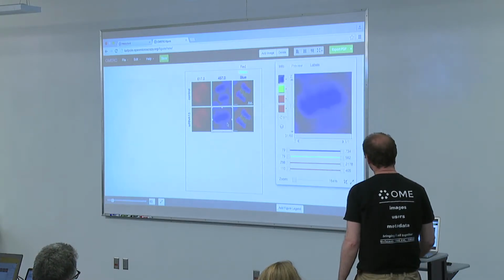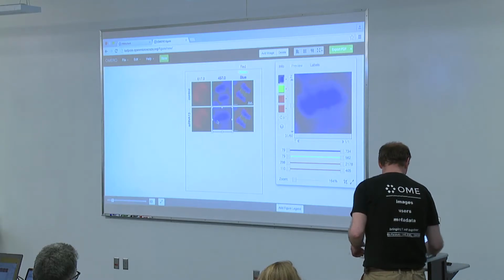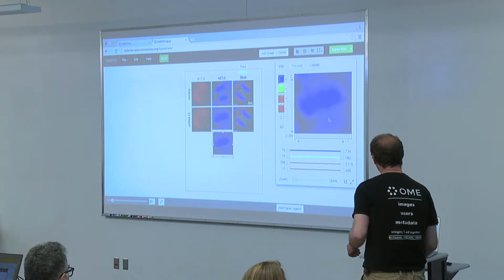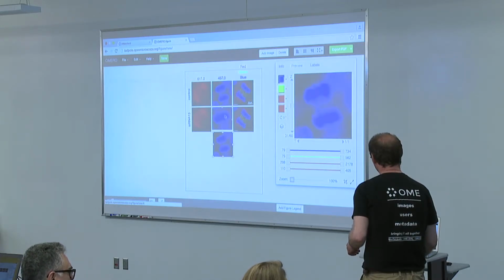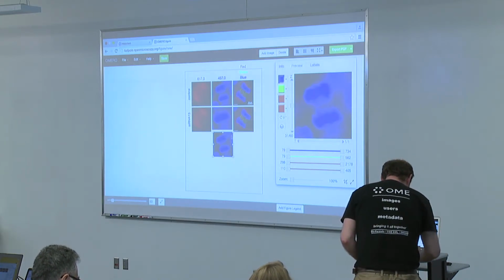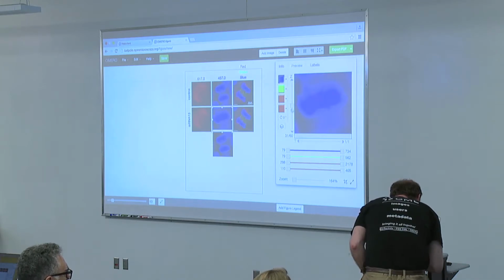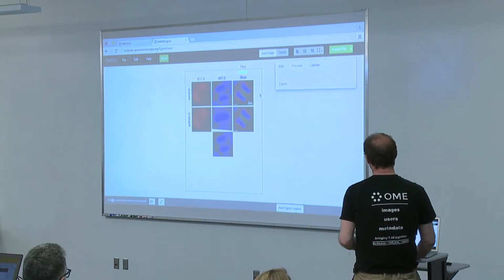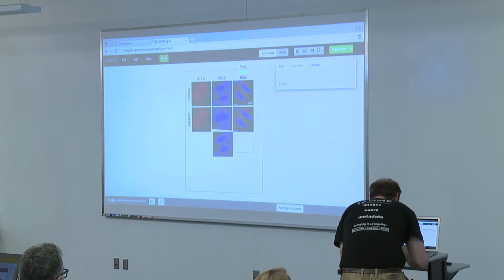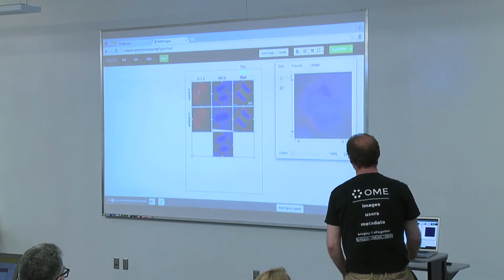And this can be your zoomed image because you can always copy the original and paste it underneath, and then go back with the zoom as it was. So this would be your zoom, this would be the original image, and so on. You can rotate the zoomed image so that it's nicely arranged. Just a little bit. Okay, it's not the best figure I've ever done, but I think concerning the circumstances, this will do.